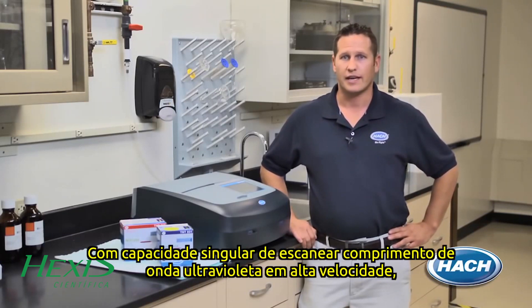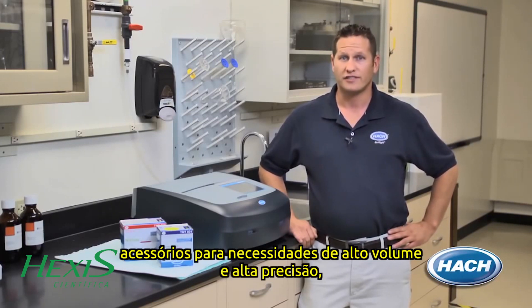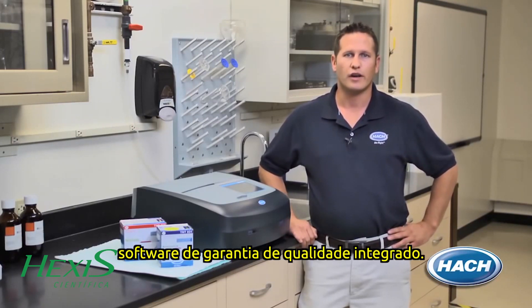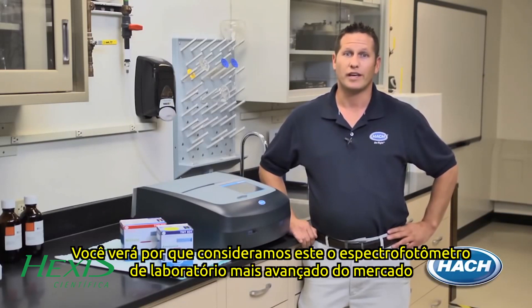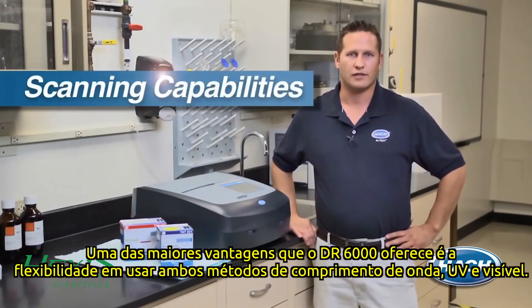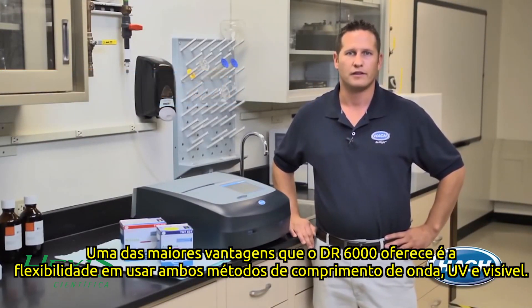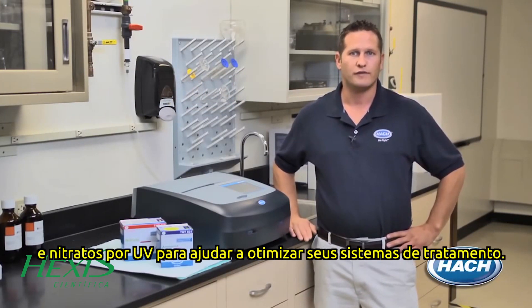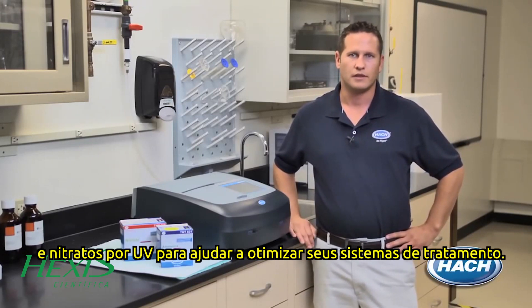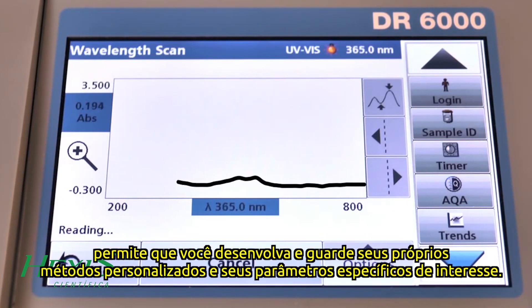With ultraviolet and high-speed wavelength scanning abilities, over 250 pre-programmed testing methods, accessories for both high volume and high accuracy needs, integrated quality assurance software, and guided step-by-step procedures, you'll see why we consider this the industry's most advanced lab spectrophotometer. One of the greatest benefits the DR6000 can offer is the flexibility to run both ultraviolet and visible wavelength methods. The UV capability allows you to run compliance methods like UV organics and UV nitrate to help optimize your treatment systems.